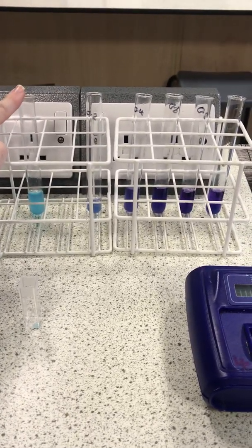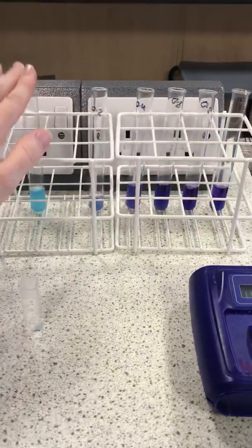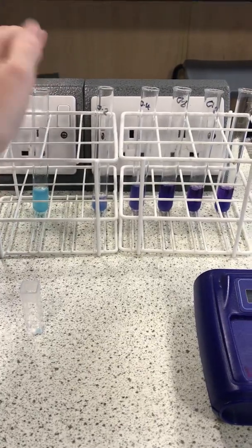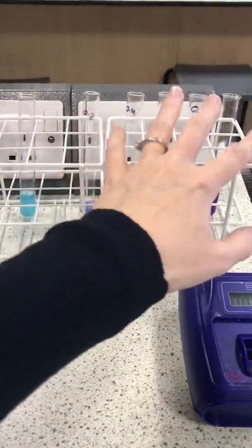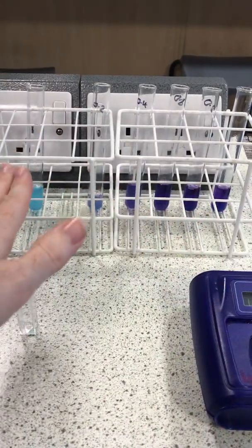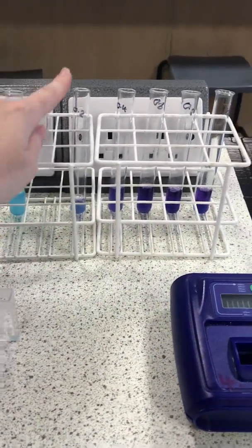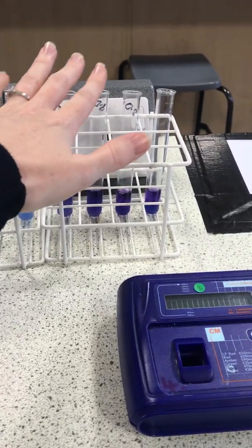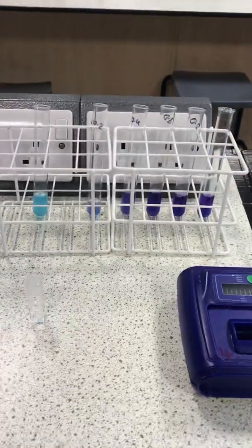This is important because the data that we generate is going to be compared to this background level here. And it takes into account that these have all had the Biuret test done. So really, we're comparing the colour of these to this background blue here. Here we have our 0.2% protein solution, 0.4, 0.6, 0.8 and 1.